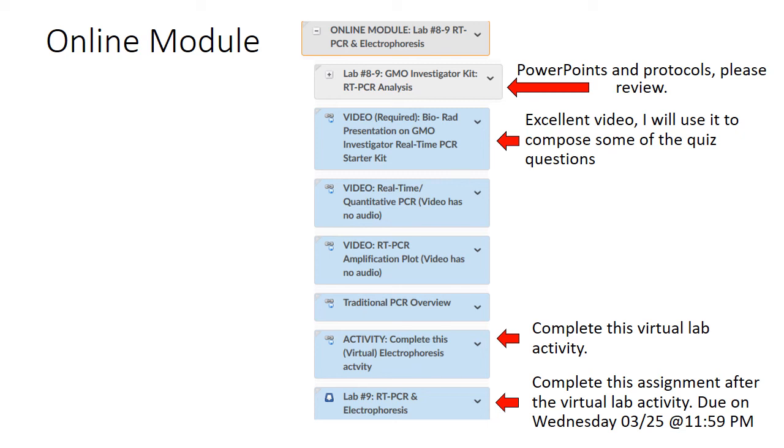The first video, which I entitled Video Required, Bio-Rad Presentation on GMO Investigator, Real-Time PCR Starter Kit, I would love for you to watch. It is about an hour long. It is done by Bio-Rad, which is the company that actually does the GMO kits that we were utilizing. In the video, they will discuss the purpose of RT-PCR, and they will also discuss how you can analyze all the different results. Please make sure that you watch this video because I will be taking some of the material and making questions for our quiz that we'll be having next week.